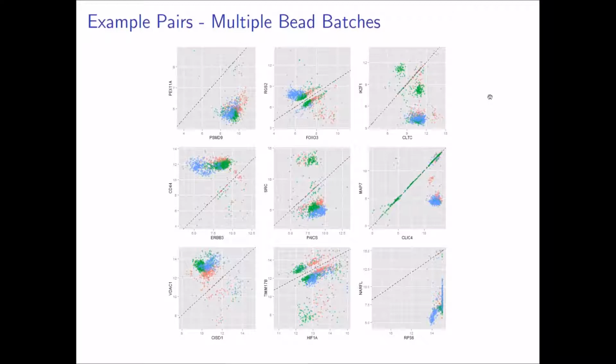The reason that I ask that is because I've seen microscopy where they're looking at phosphorylation events or endocytosis or a number of other things, and there's profound heterogeneity even within the plate itself, so that cells that are in clumps look completely different than those that are isolated. The ones that are isolated have much more active signaling, migration, endocytosis, as you might imagine, because they're moving, and the ones in clumps are sort of dormant. And this could be, if your cells are more or less dense or confluent, then that might affect the results as well.